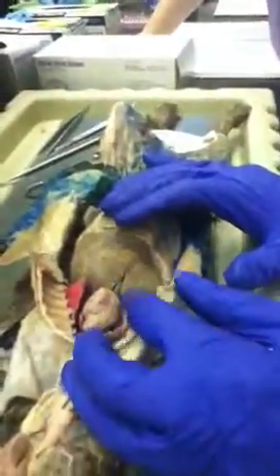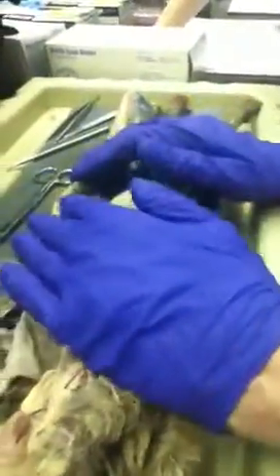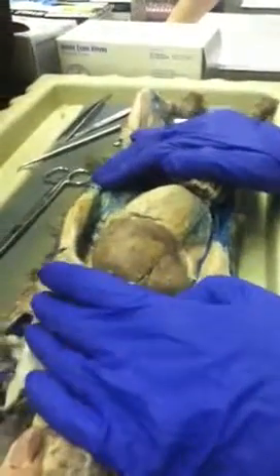So if you just keep parietal and visceral, visceral is easy to remember because that means guts. That's going to be on the organ, whatever it is. Parietal is surrounding. It's part of the chamber. And again, a lot of that surface, I think, and fluid-filled space has to do with reducing friction between organs and body wall, so that the organs are free to move and they're not dragging against or pulling the body wall with them. You'll recall that organs don't just fall out, they're suspended in mesentery.